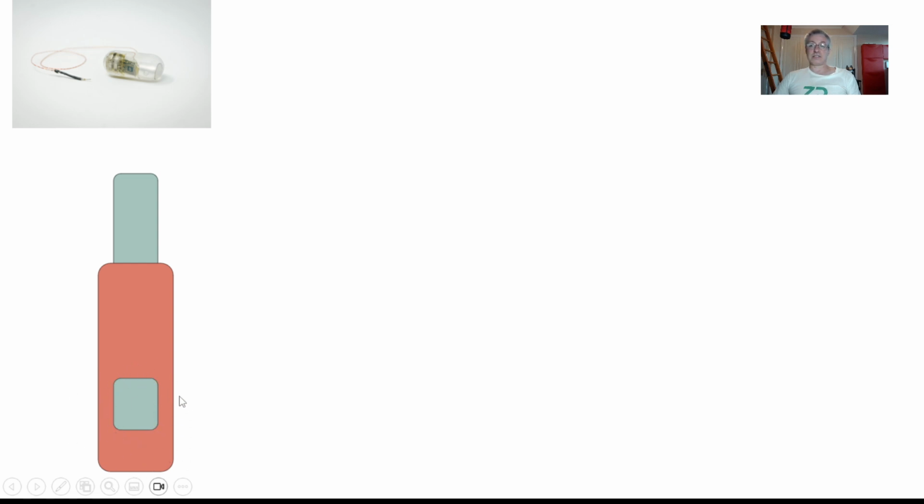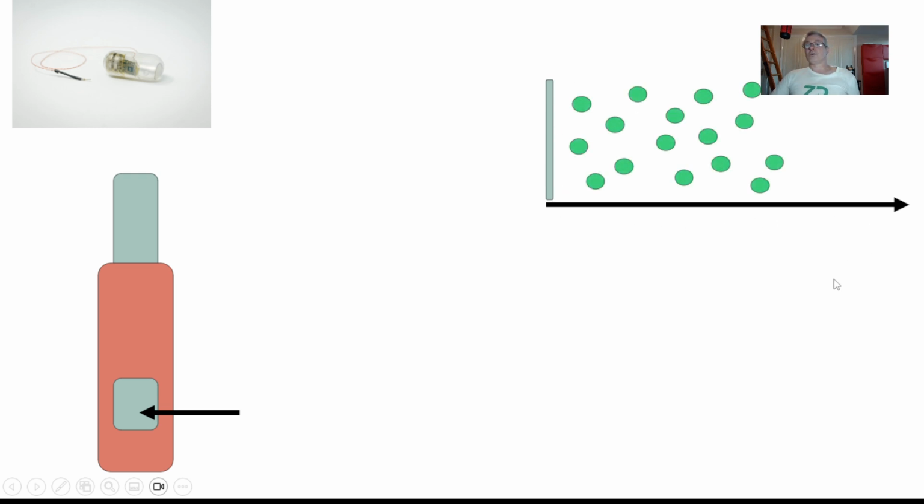Now the signal is proportional to that known area of electrode, and I will have equations in a minute for that. So the electrode is really here, because this is the known area that you've opened up in that insulator. Now this is the electrode surface, and this is distance from the electrode. So you're sitting in some solution of electrochemically active molecule. I'm keeping this very generic at the moment. And at t equals 0, you're applying no voltage. So there's no current flowing, and there is no consumption of this electrochemical material.